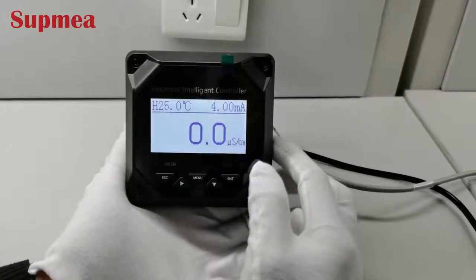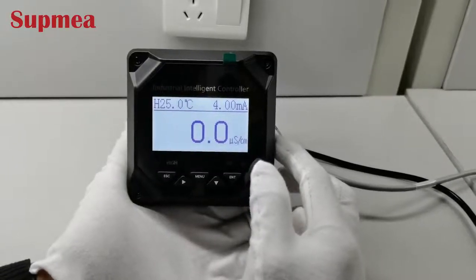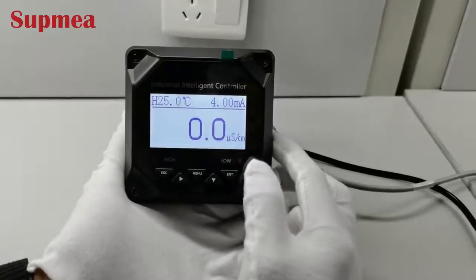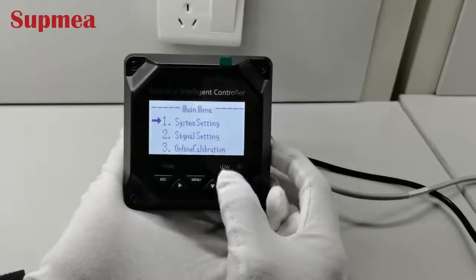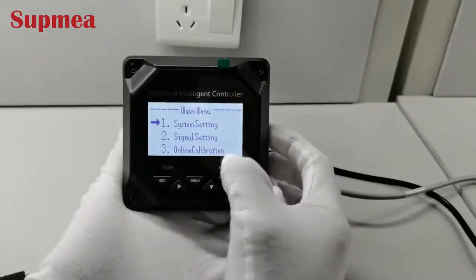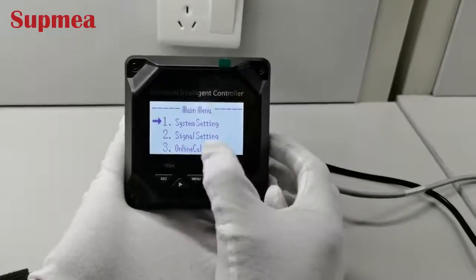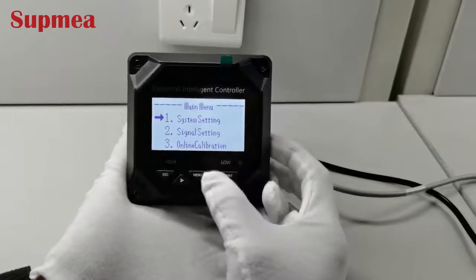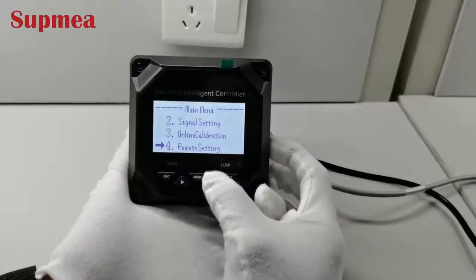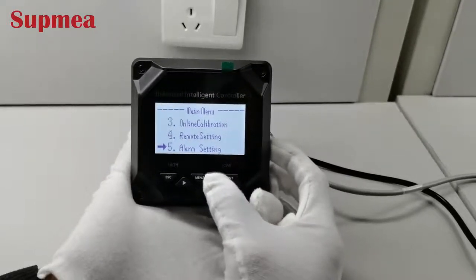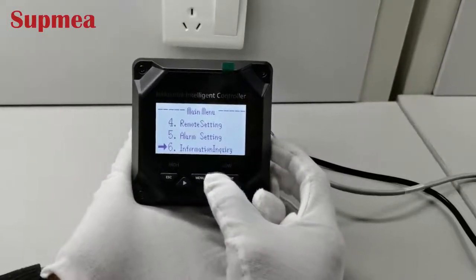Let's see what are the configurations of the controller. First, press menu, and then enter. Here are the list of the configurations of the controller: system settings, signal settings, online calibration, remote setting, alarm setting, and information inquiry.